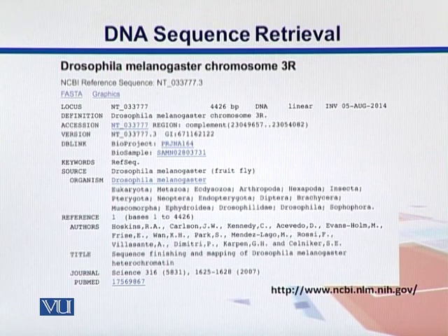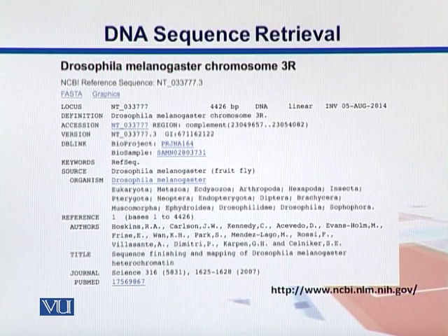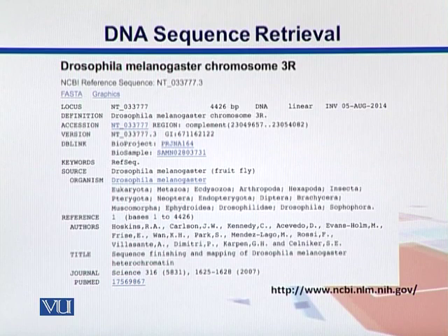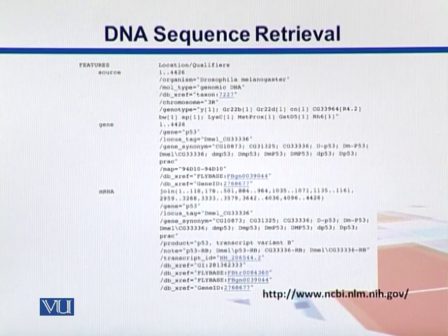We also have the variant, which says 033777.3. There should have been versions .1 and .2, and since this is the third review, we see .3 in the name. Down below we also see the references and authors from which this gene is coming, along with their publication — it was published in Science. Scrolling down, we see the features of this gene. The total length of the gene is 4426.